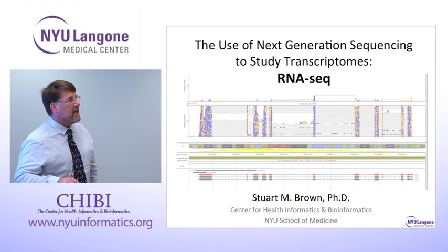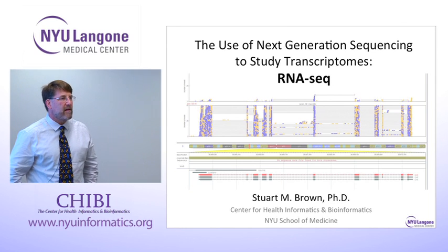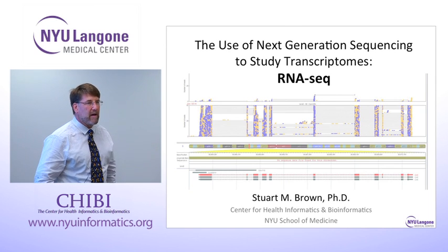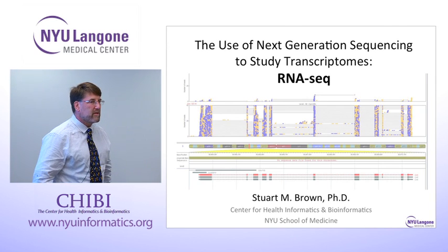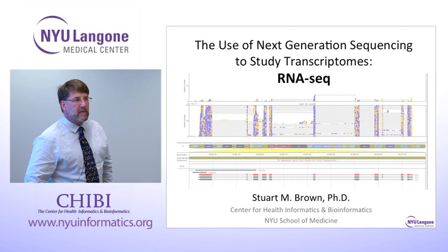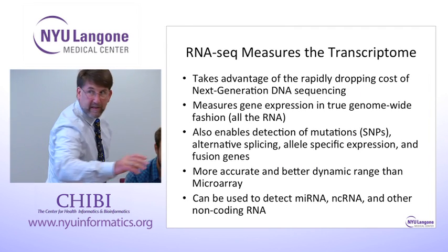Today I'm going to talk about RNA sequencing, RNA-seq. This talk isn't going to be about a single biological system, and it's also not going to be about laboratory aspects of how to prepare your sequence and the specifications of the sequencing machines. It's going to be about bioinformatics aspects of data analysis and basic theory, and then some examples from various collaborators that have been working with us where we've been doing data analysis. Okay?